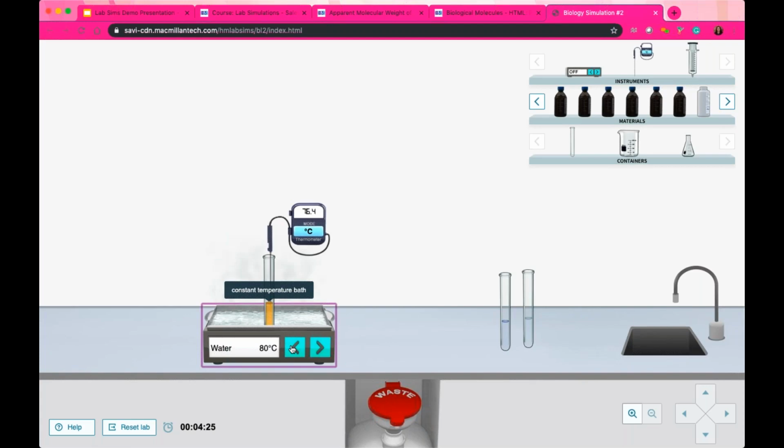They do have a little bit more freedom. The other thing that's nice about that is that if you chose, instead of using glucose, you want them all to use maltose, you could alter the procedure from semester to semester so that instead of glucose, they're using maltose. You could have them use several. You could do a pretty nice little customized lab pretty easily because you have access to all of those materials.